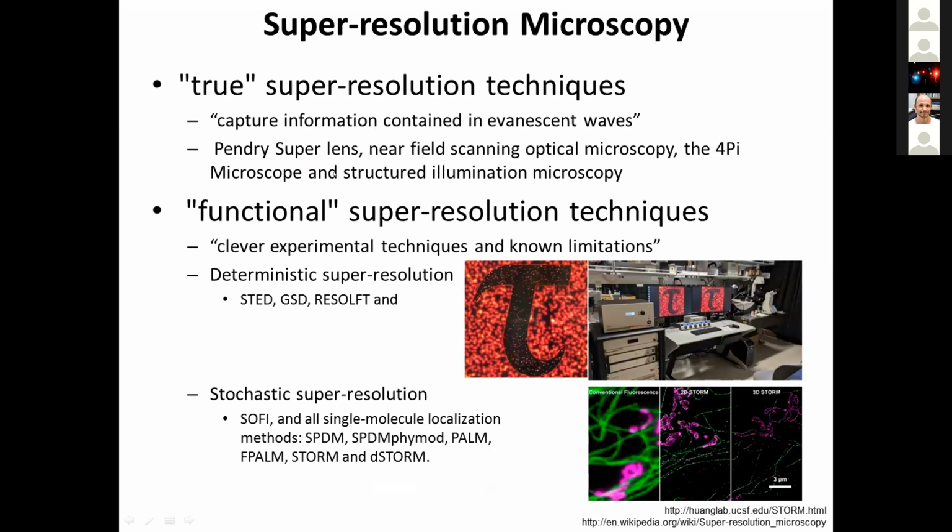The most novel techniques related to super resolution can be split in three. I will not speak much in detail because we will have a couple of very nice lectures on Thursday by Luca Lanzano and Fernando Stefani, related to true super resolution, functional super resolution, or stochastic. Basically, doing different kinds of approximation, we can break the diffraction limit, and today we can go down to nanometers, as we will see in these lectures.